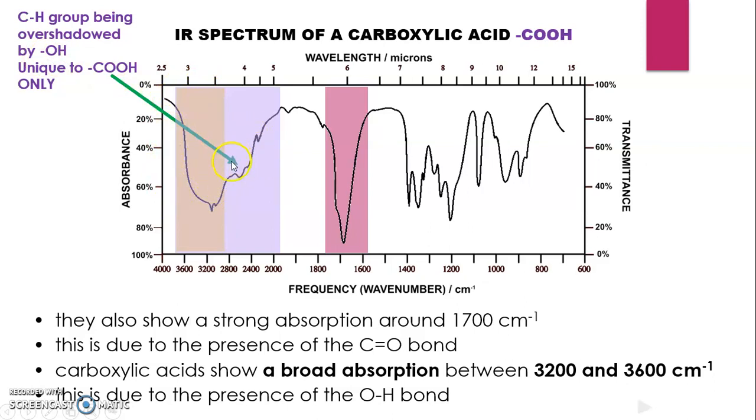So this peak, due to the strong absorption of the hydroxyl group, sort of merged into it and became one fat band. And it will only happen when the hydroxyl group is right next to a carbonyl group. Yeah? So only a carboxylic acid will have this kind of overshadowing effect at the higher end of the spectrum. And therefore, when we see this kind of pattern, we have to go straight to find that carbonyl group absorption and therefore confirm that this compound is a carboxylic acid.